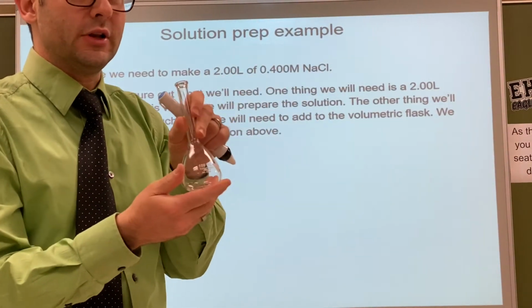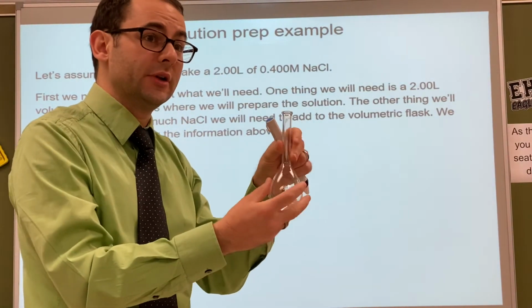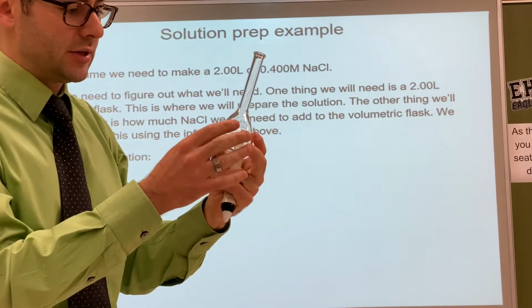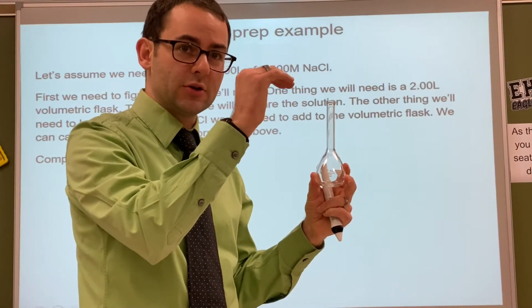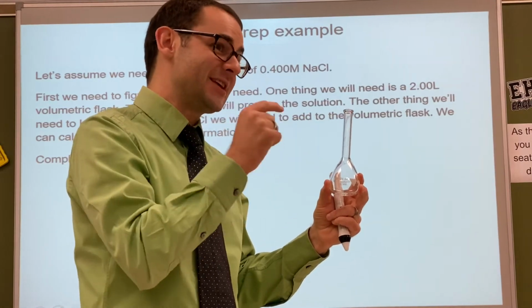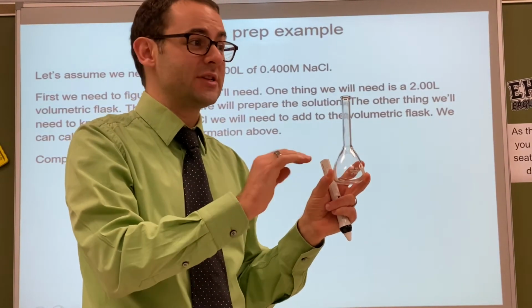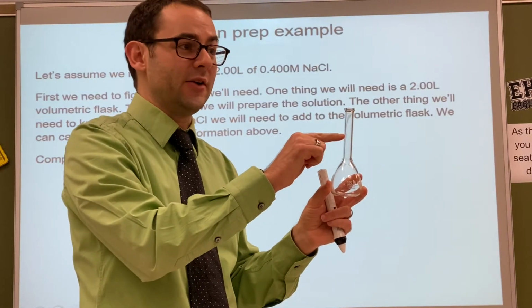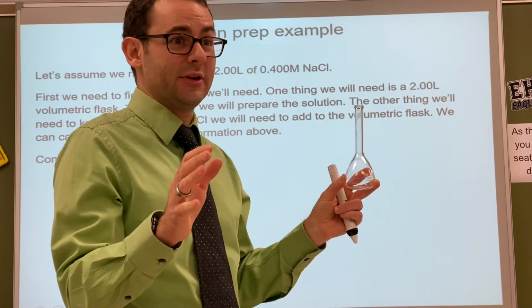This is 100 milliliters. For our lab today, we're going to use a smaller amount. So we're going to make 100 milliliters. These are pretty interesting because you know how you measure usually with a graduated cylinder, it has all the markings on it? This has one job, and that's it. It's to show you 100 milliliters, exactly. There's one line on it. That's all it does.